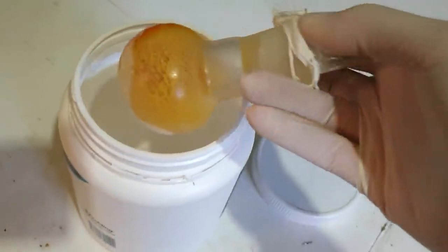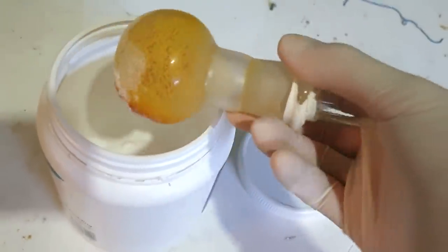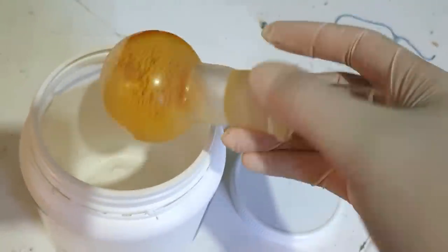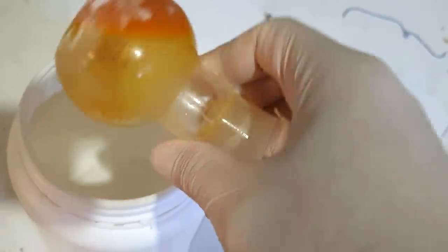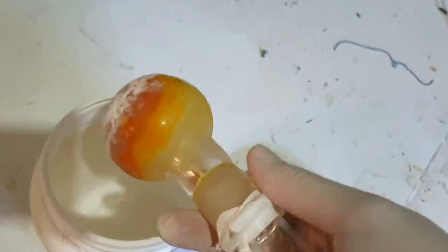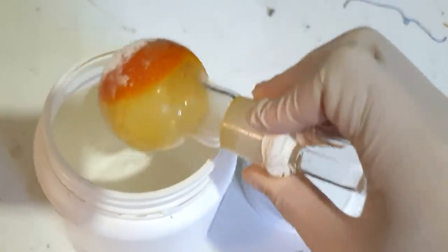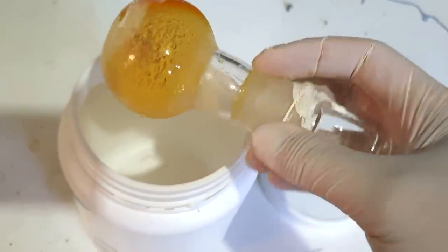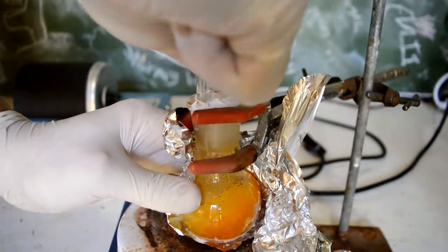Here we are the next day, and hell yeah, I mean, it could all be dioxane frozen in there, because it's been in the freezer, and dioxane freezes at some reasonably not too cold temperature. Looks better than that. It looks like there's some solid in here. It looks really good. It looks like our lazy method has actually worked. So what I'm going to do is let this warm up slightly. I'm going to add some water to it. Water should crash out any remaining stuff from the dioxane and dissolve the dioxane. Filter, wash with a little ice cold methanol, and then dry thoroughly on the pump.